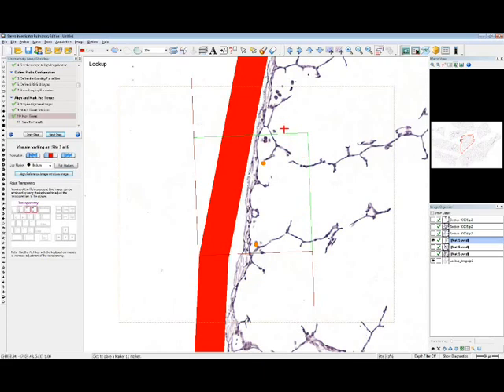And I also should point out, you see the boundary line is a pretty thick red line on the screen. We actually could easily change it to look very thin. So it's just a function in the software. I have it pretty thick so you could see it easily for your presentation, but normally it would be a very thin line that will not be in the way of the image.